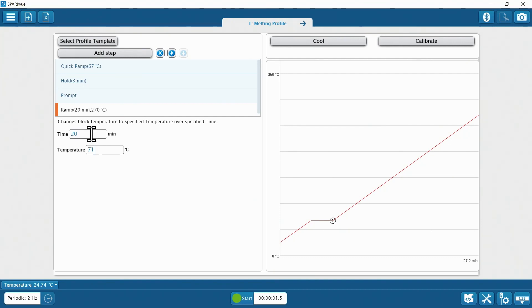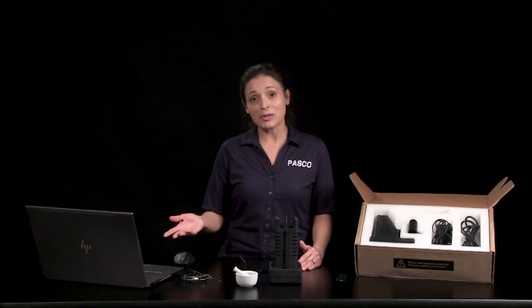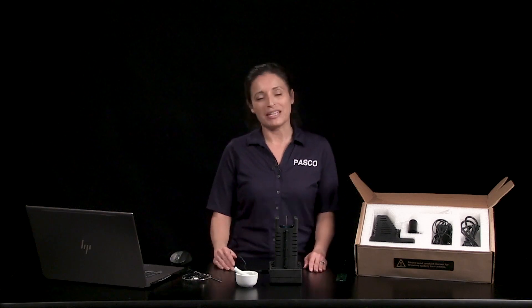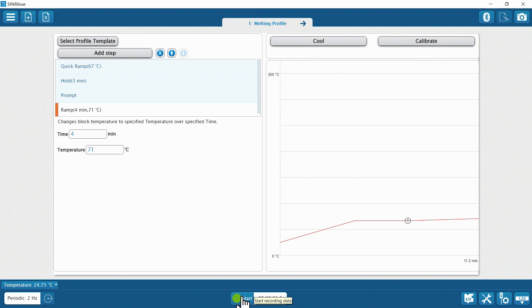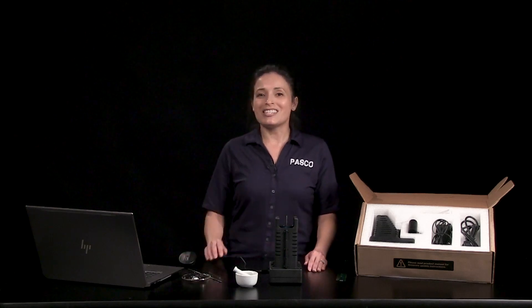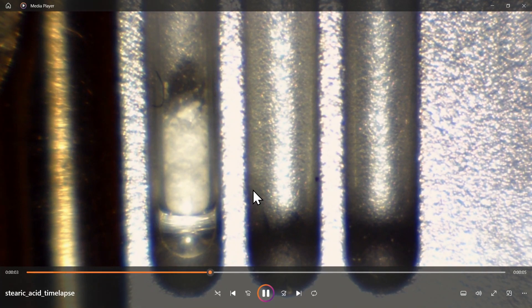You can always go higher because you can hit stop anytime once melting is done. For best accuracy, don't heat the unit faster than one to two degrees Celsius per minute. Since the temperature difference between quick ramp and ramp is only four degrees, you could set time anywhere between two to four minutes. The estimated runtime is 11.2 minutes, but the actual runtime could be greater or less. Now I can hit start and monitor the temperature in SparkView's live data bar while observing the sample through the eyepiece. Here's a time-lapse sequence of what you would see in the eyepiece during ramp — sped up over 150 times — and that entire run took about 13 minutes from start to finish.